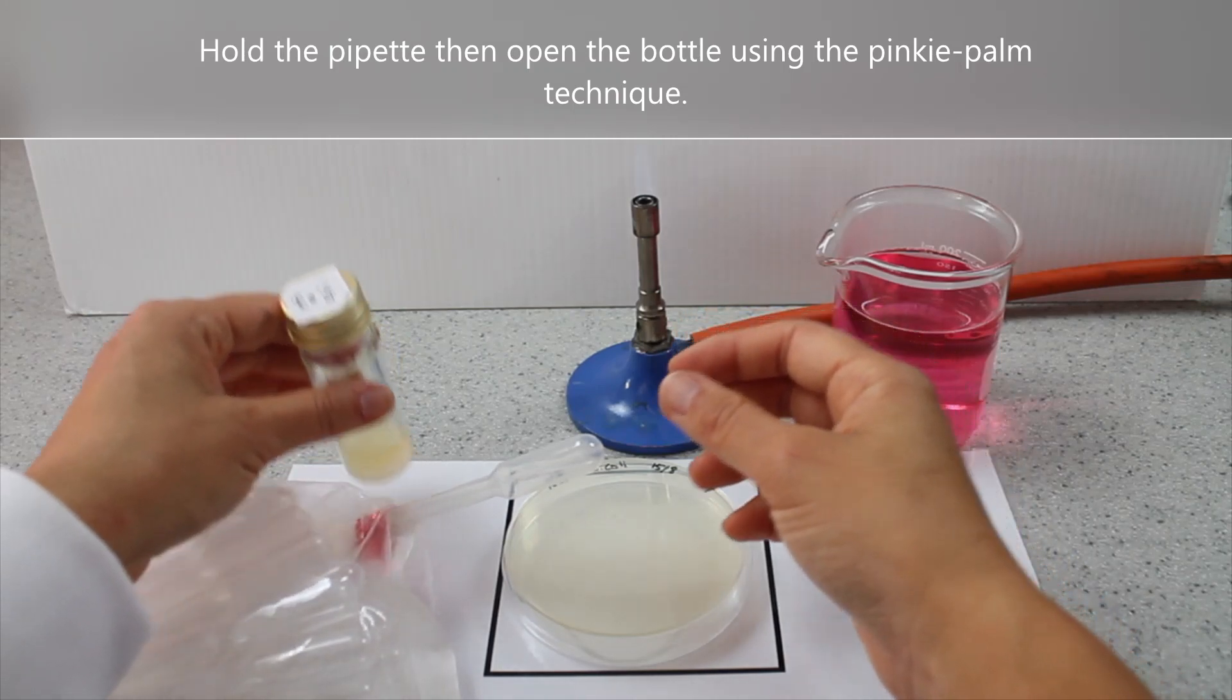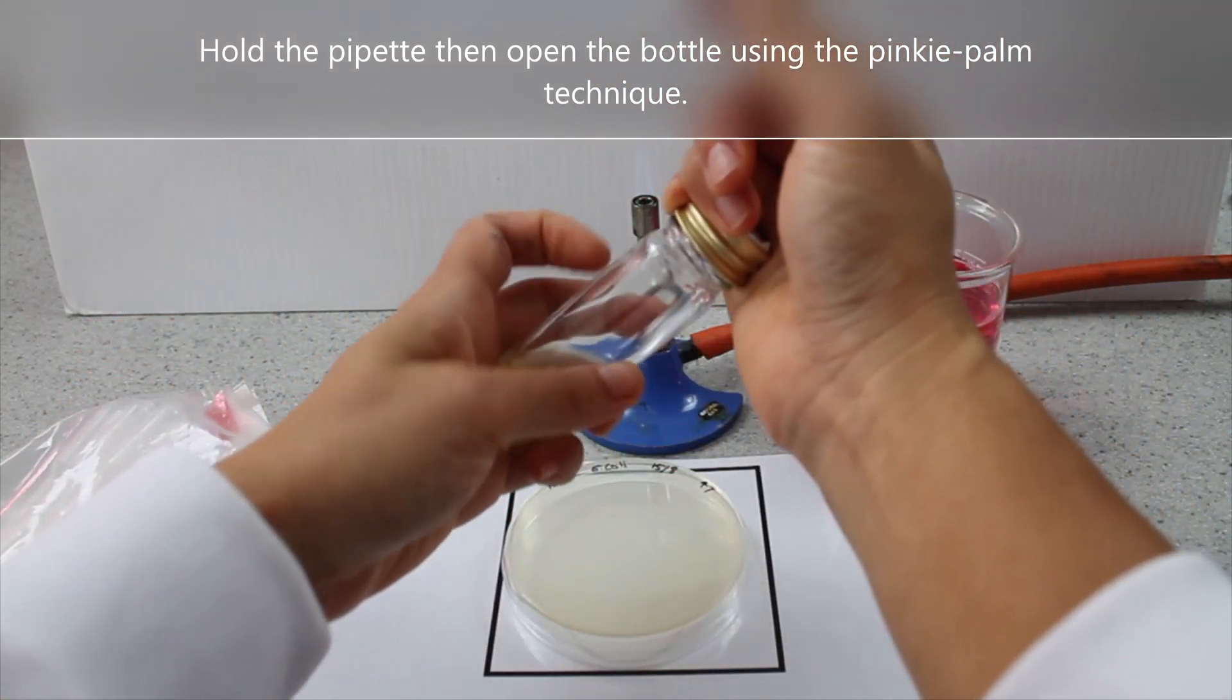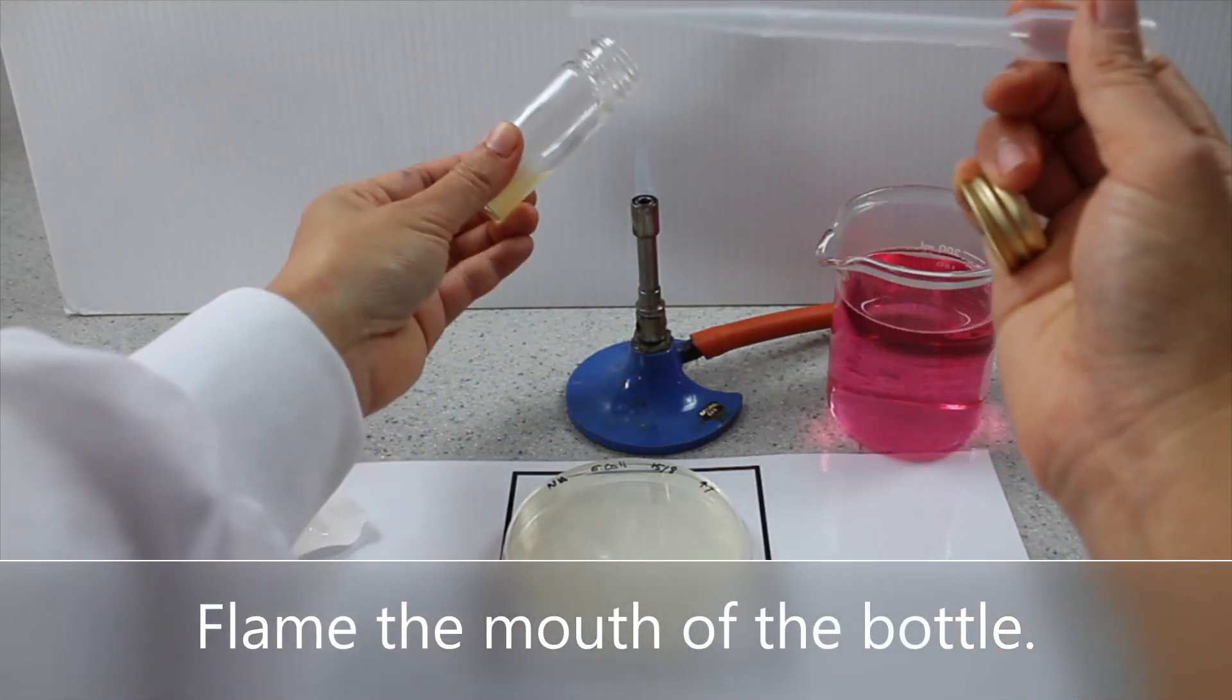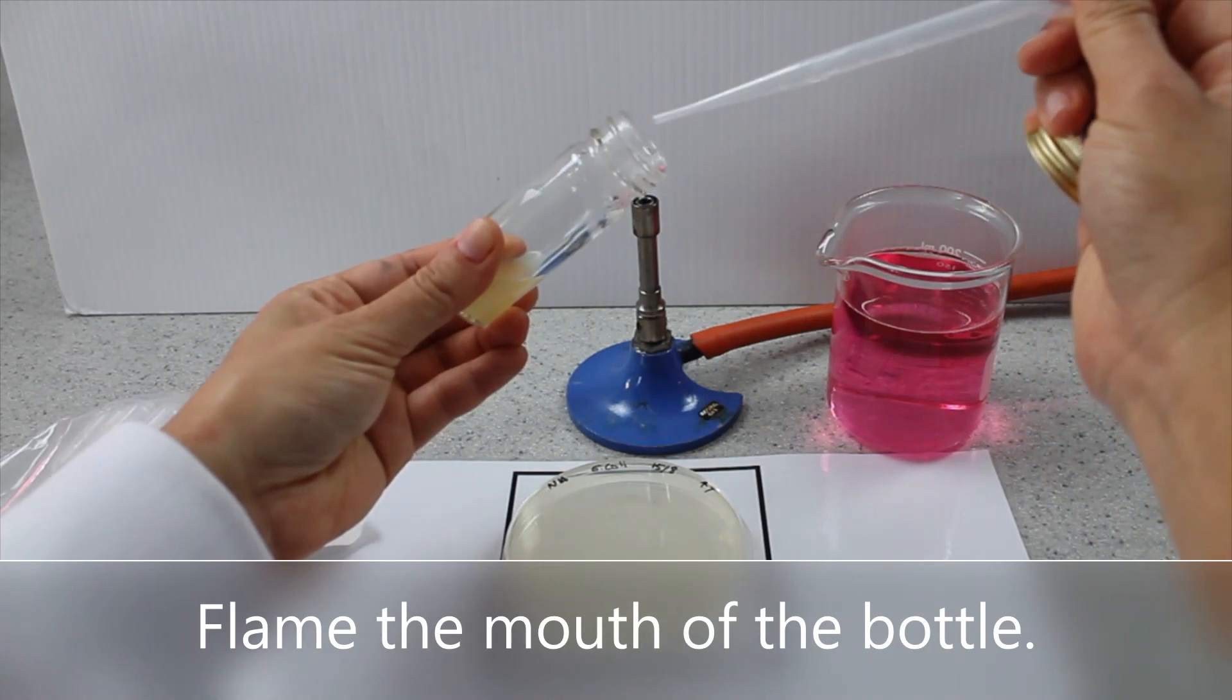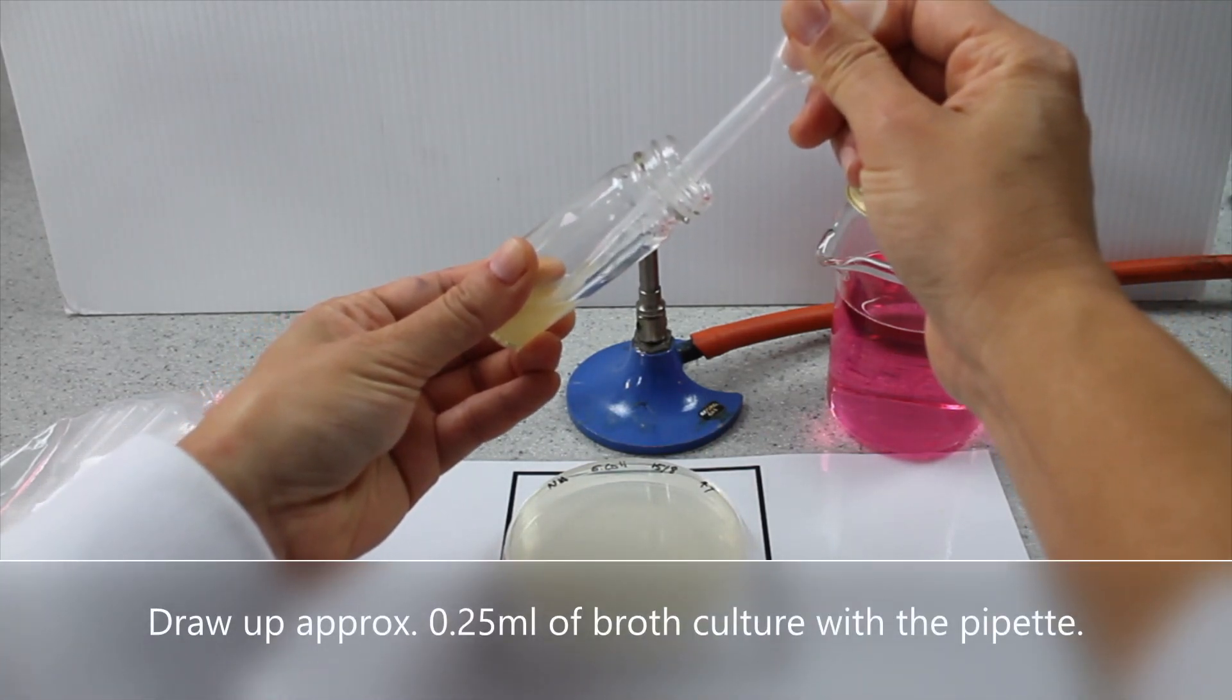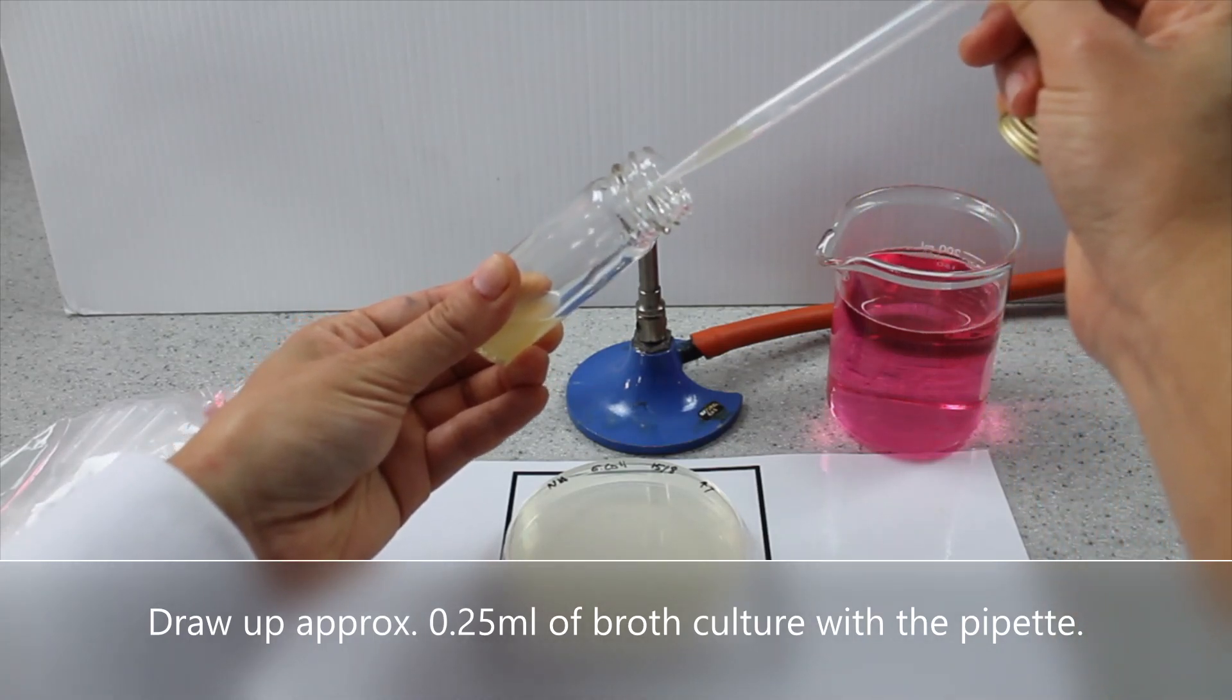Hold the pipette then open the bottle using the pinky palm technique. Flame the mouth of the bottle. Draw up approximately 0.25 ml of broth culture with the pipette.